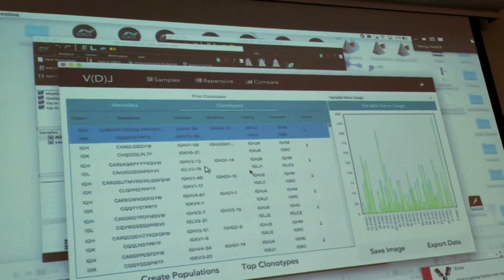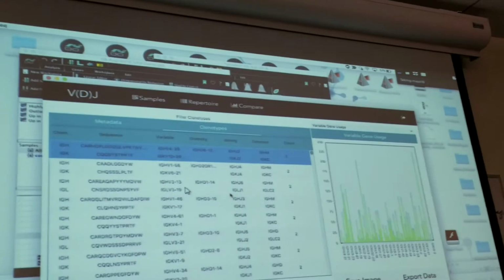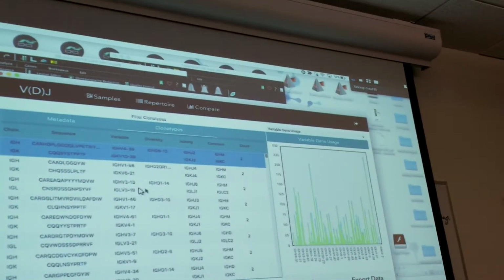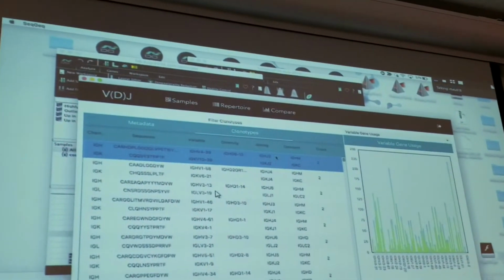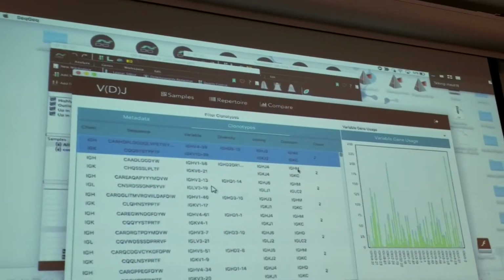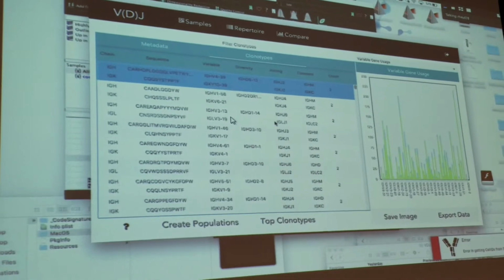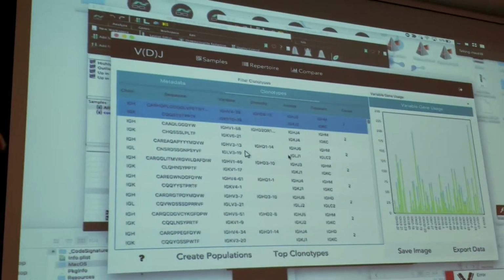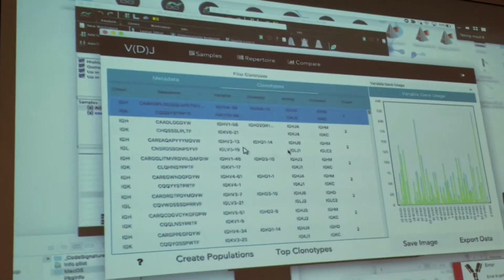And then, of course, there's a redundancy here because it has chain at the beginning and constant at the next to last, and they're redundant. But in any event, I think, that doesn't say IGH and IGM. Okay, so they're not redundant. So all this information, we can plot, look at density and groupings of one person versus another.